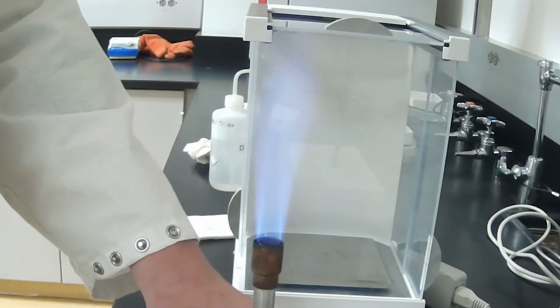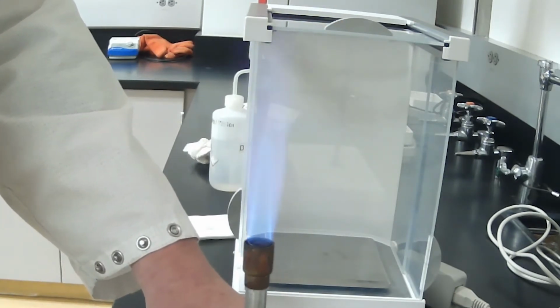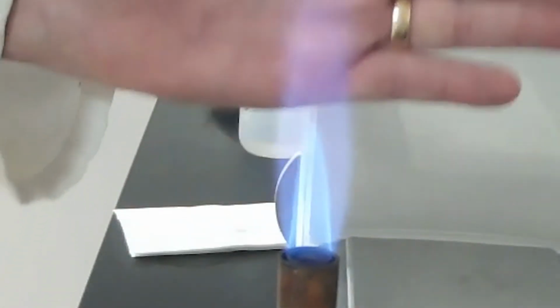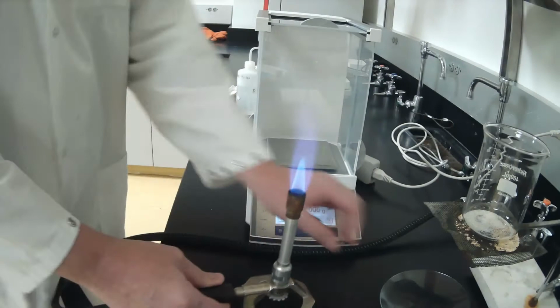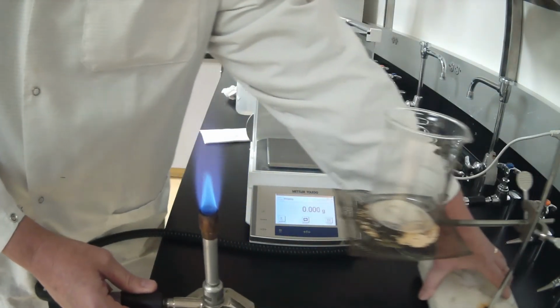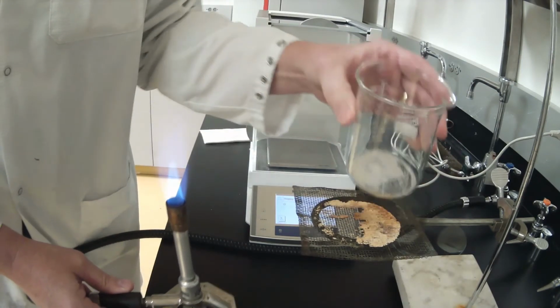And I'm going to decrease the gas flow a little bit on the high side. I want a lovely bright blue cone. I'm going to hold my hand behind it so you can see that I have an intense cone.